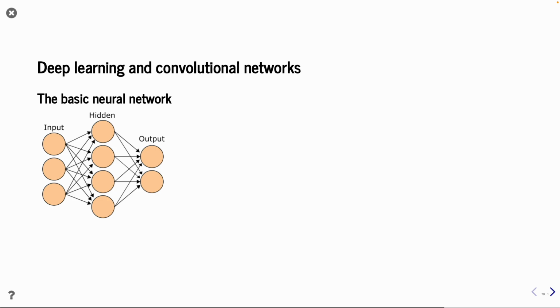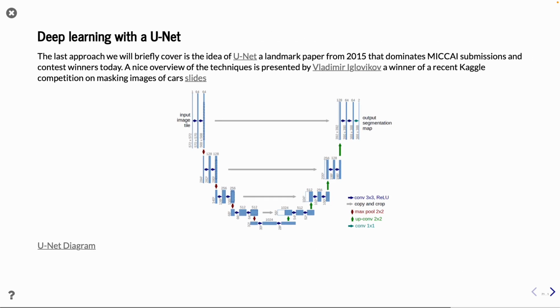The development went on, and during the last 20 years we got new graphics cards, and we could do much fancier stuff. That brought us the convolutional networks, which were much larger and deeper, with more nodes and more layers. The important thing is the convolutional part, because each of these nodes now performs a convolution of some kind, and each node contains a kernel that is sensitive to specific information. So now the training turns into tuning not only the weights, but also the shape of these convolutional kernels.